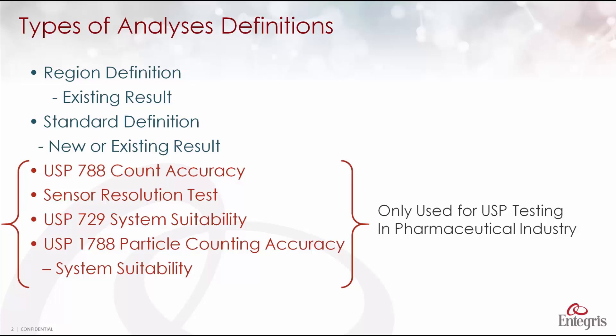The region definition for creating reports on existing results, the standard definition for creating reports for new or existing results, and then these definitions which are used only in the pharmaceutical industry when performing certain USP tests such as the count accuracy and sensor resolution tests.